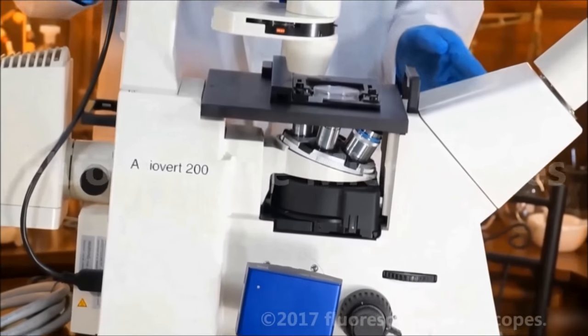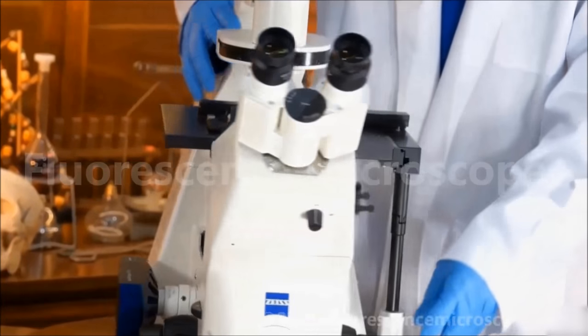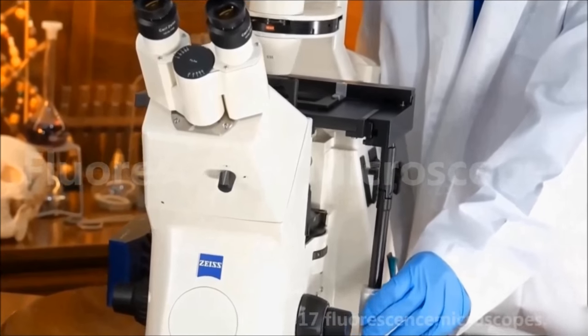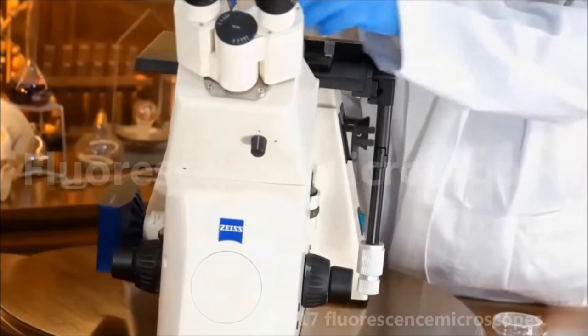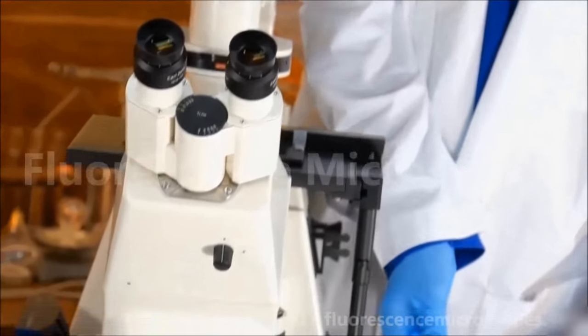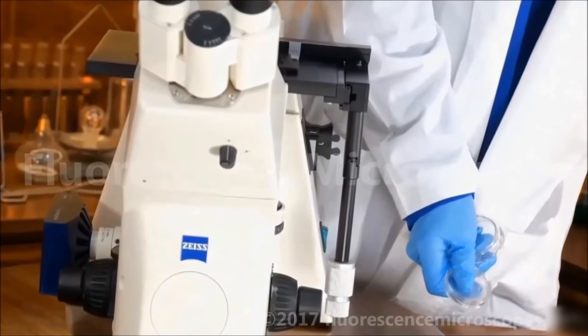We have an XY stage. It is moved by a low position XY, and we've got a Petri dish on it at the moment. This Petri dish, all these Petri dishes are not included. We're just using them as examples.